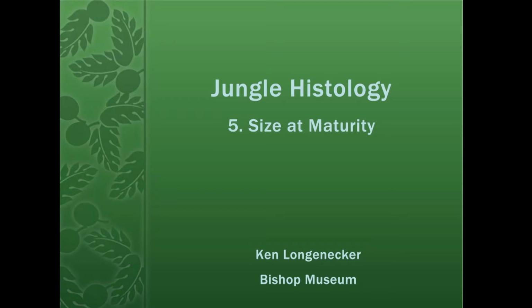My name is Ken Longenecker and this is the fifth of 9 modules designed to teach anybody who's interested how to perform the methods my colleagues and I use to do rapid reproductive analysis on coral reef fishes. The topic of today's module is size at maturity.